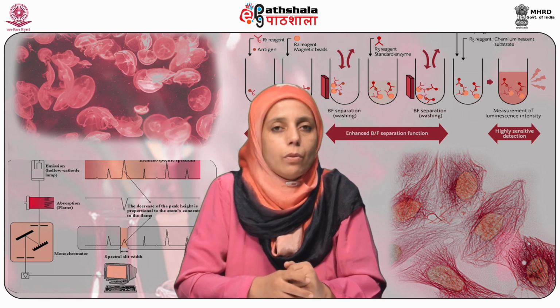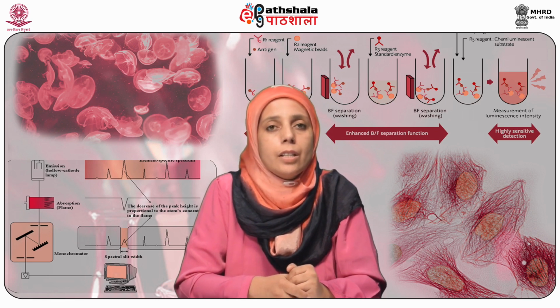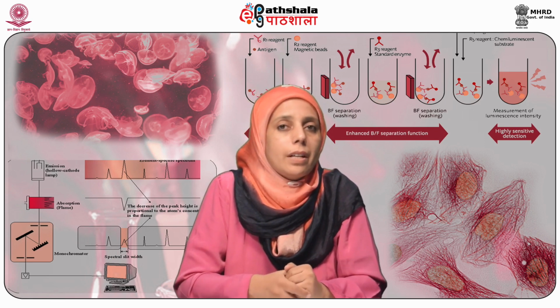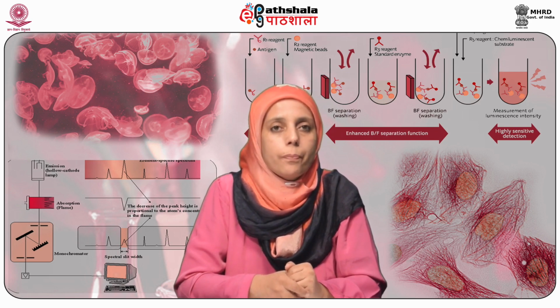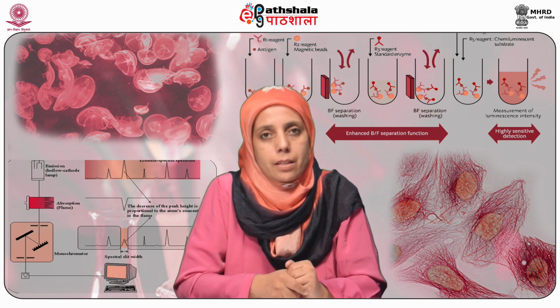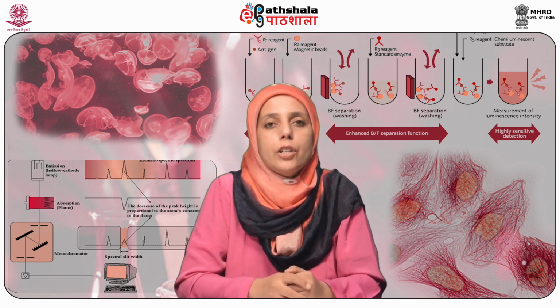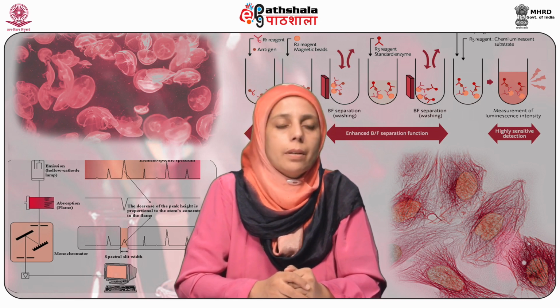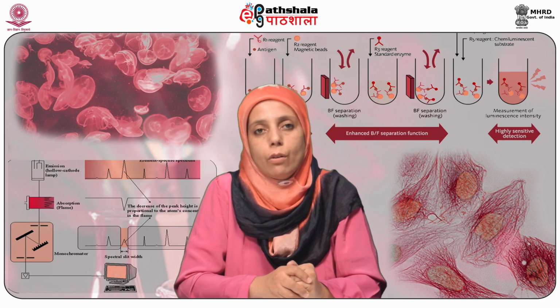It can be a 150 watt, 450 watt or 1000 watt lamp. In instruments, a 75 watt xenon arc lamp has also been used, but it's pulsed so that the peak intensity of each pulse is high. In addition, both molecular and chemical environment determines whether a substance will or will not fluoresce.